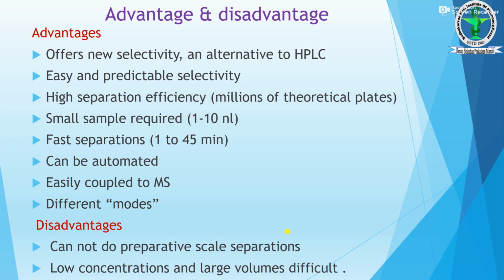Then we study the advantages and disadvantages. What are the advantages? It offers a new selectivity and is an alternative to HPLC. It is easy, predictable and selective.